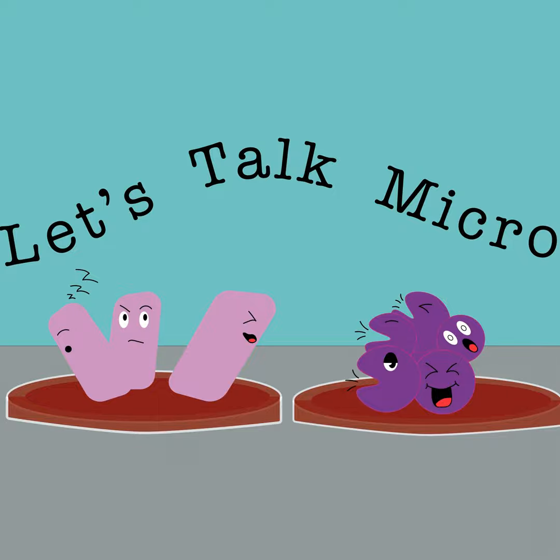I love the different simulations to teach them about microscopy, but somehow, I think it might have been on a biology Facebook page, this program out of the University of Toledo called SCOPE, and SCOPE stands for Scientists Changing Our Pre-College Education. Somebody had posted, hey, educators, we know that everyone's scouring around to try to find an alternative for microscopy, and we are offering teachers to have their students remotely control a scanning electron microscope.